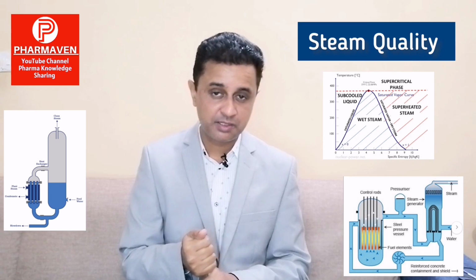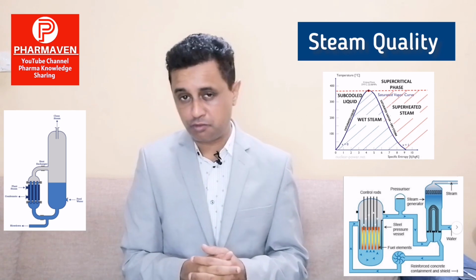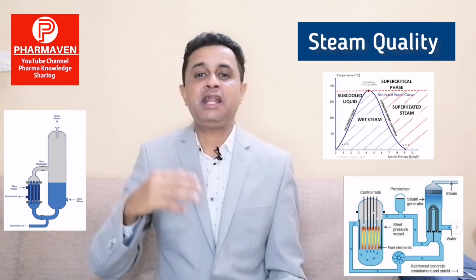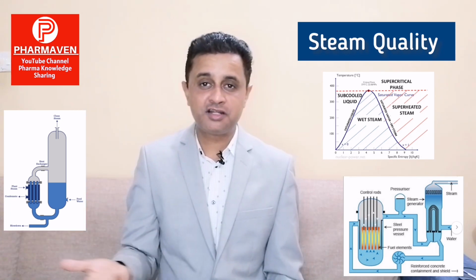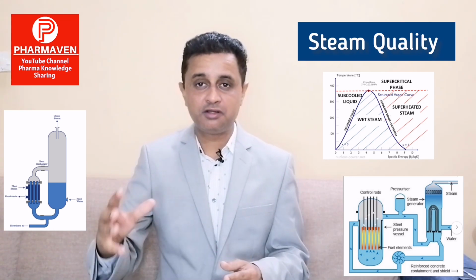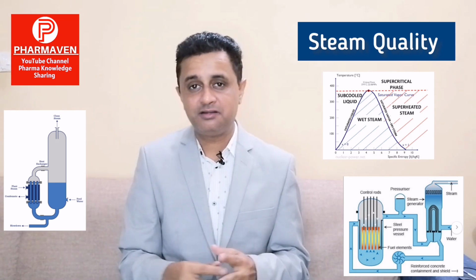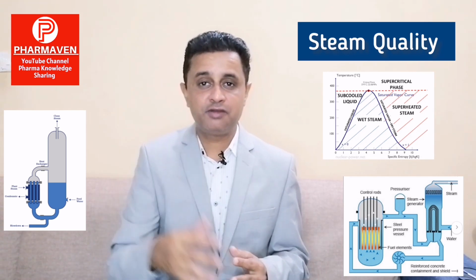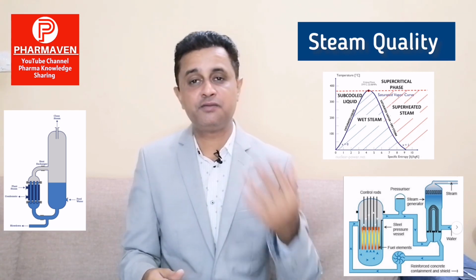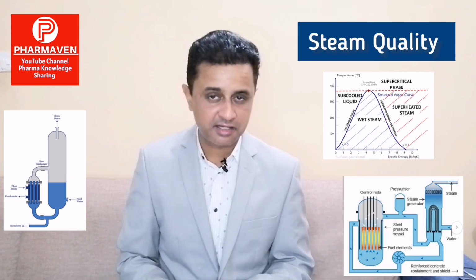We may also repeat the steam quality test for that specific steam supply at that specific location of the autoclave chamber, and verify whether any steam quality issues are there. We might have a problem with the steam flow, maybe insulation is missing somewhere, or there is a leak in the steam supply, at the generation point or distribution points, which can impact the steam. Also we have to check whether there is a clearly defined procedure to remove condensate before we start the cycle. For example, on the very first cycle of the day, we may want to remove the entire condensate in the line before we go for the actual cycle.